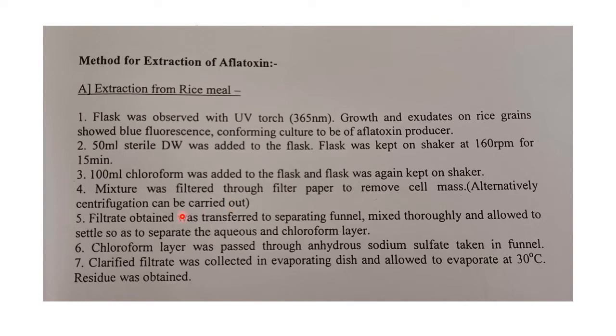Then the filtrate obtained was transferred to a separating funnel, mixed thoroughly and allowed to settle so as to separate the aqueous and chloroform layers.